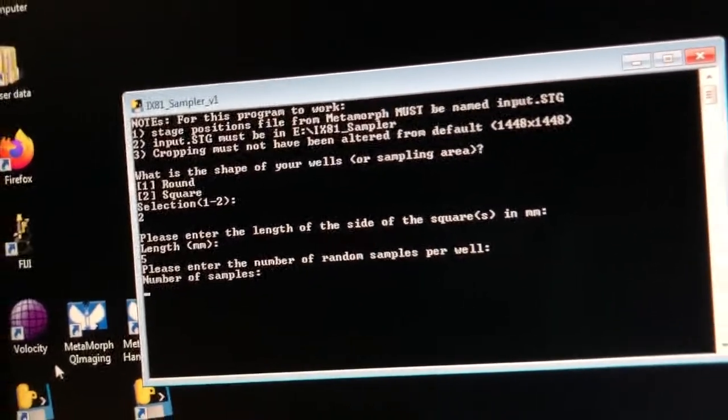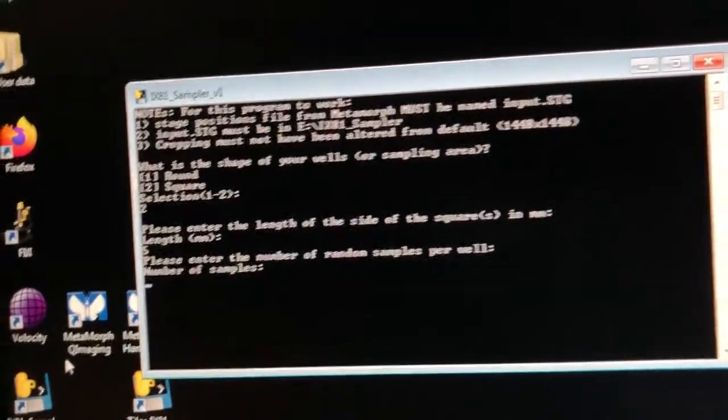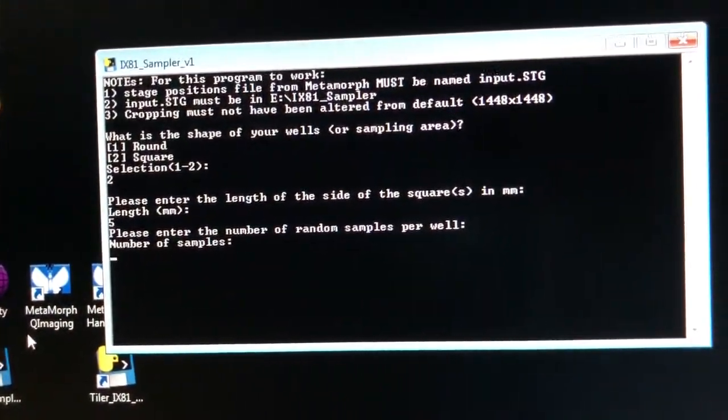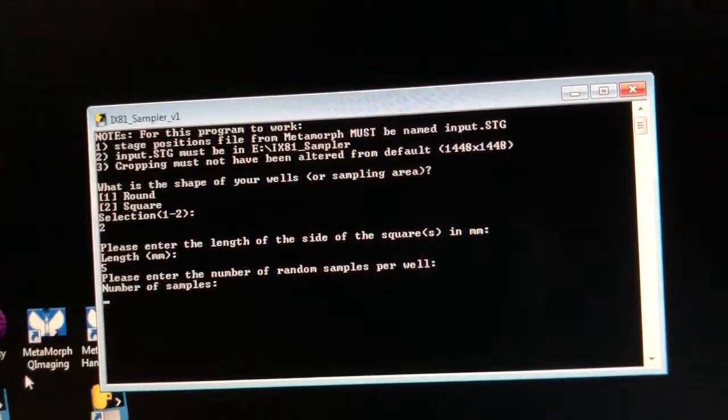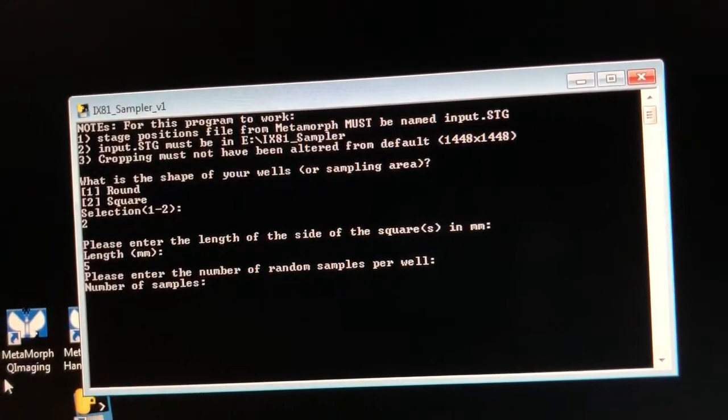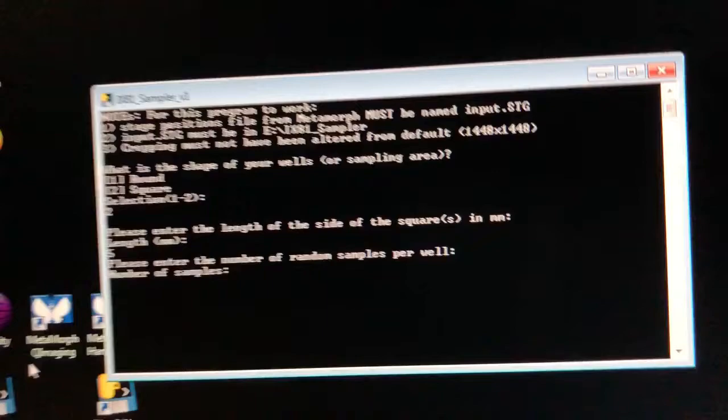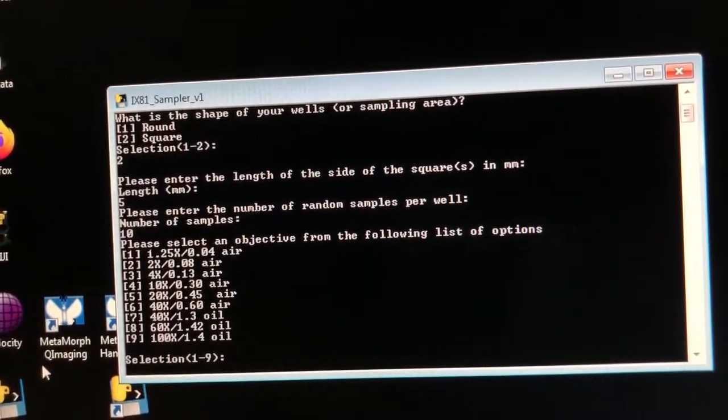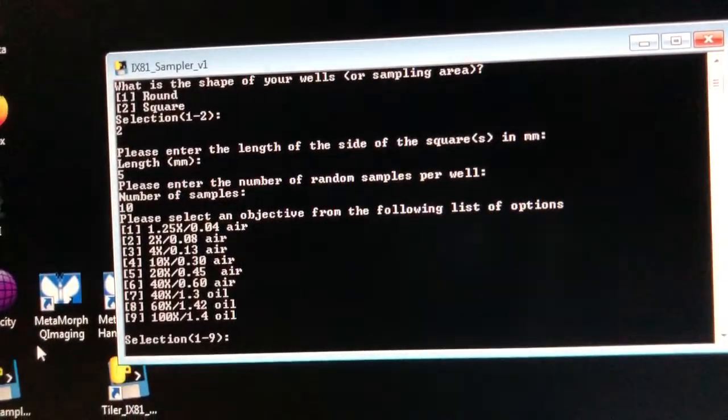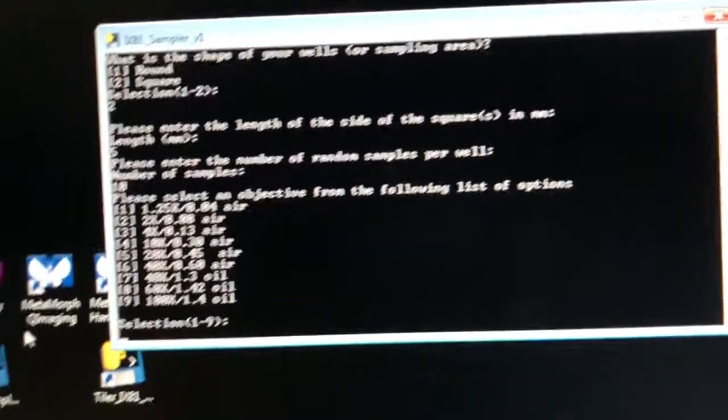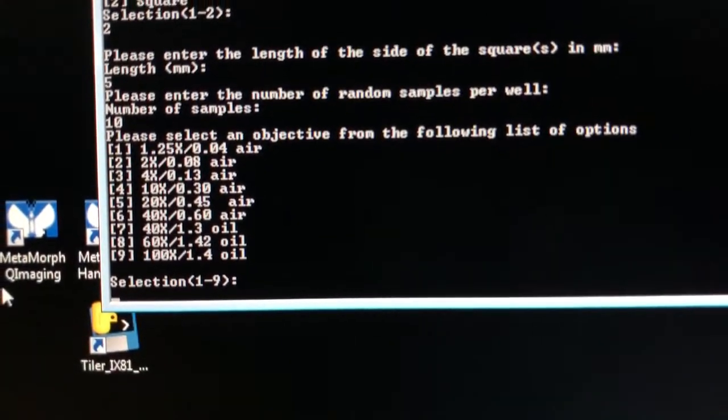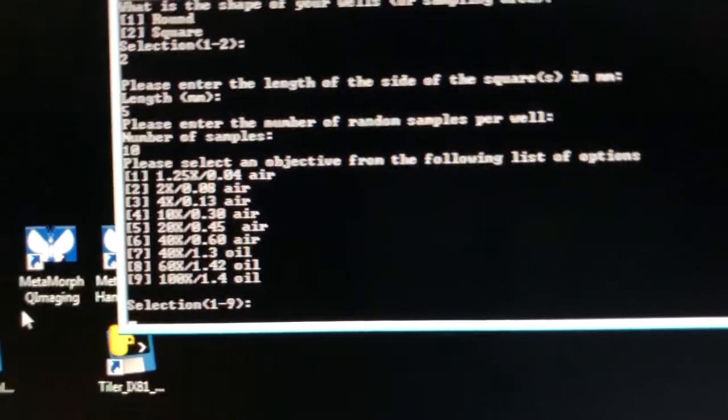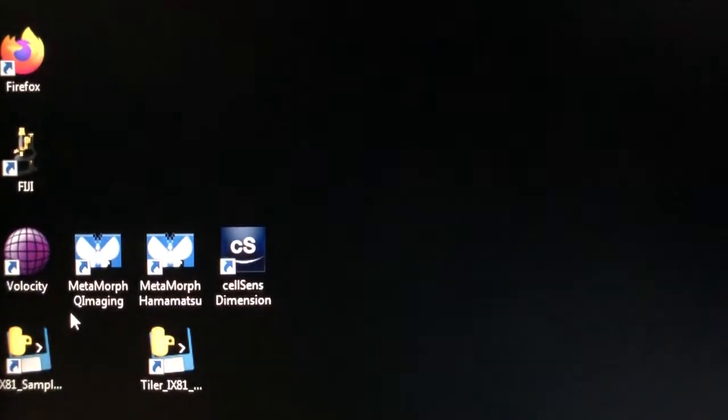Please enter the number of random samples per well. So how many should I take? So this is up to you and you should do some pilot studies and ideally a power analysis to figure out how many you need. But for the sake of this demonstration I'm going to say 10. So then it says select the objective from the following list of options. Just trust me we're on the 20x air objective which is in this list option number five.